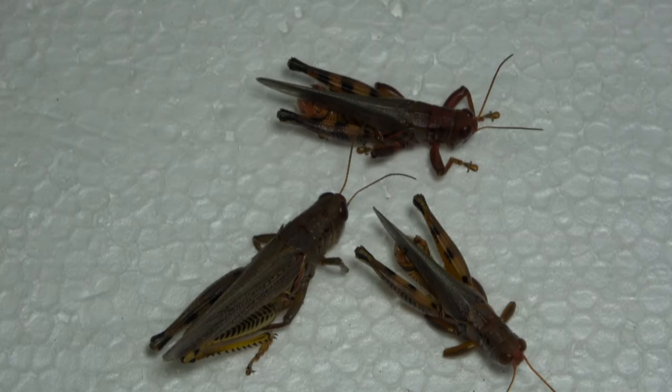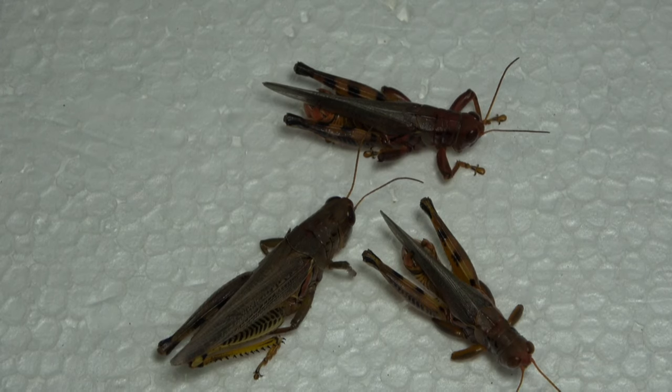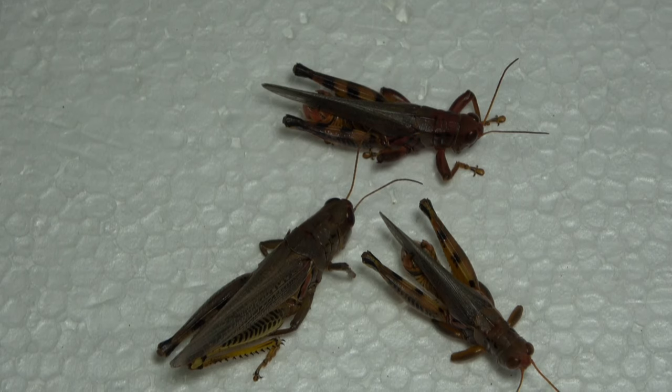Hello everybody, welcome to Daily Entomologist. In this short pinning video I'm going to go over how I pin grasshoppers and orthoptera in general. I caught a couple of Melanopolis differentialis in the yard and it is time to pin them out.